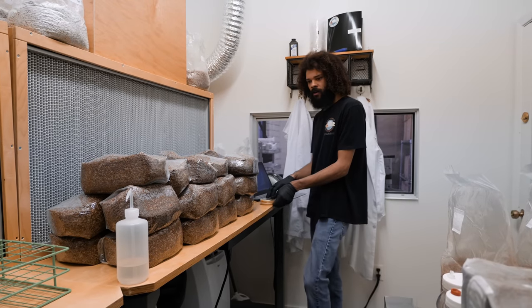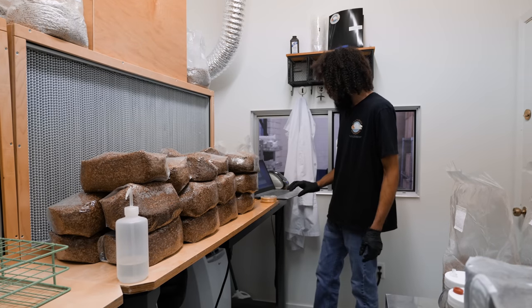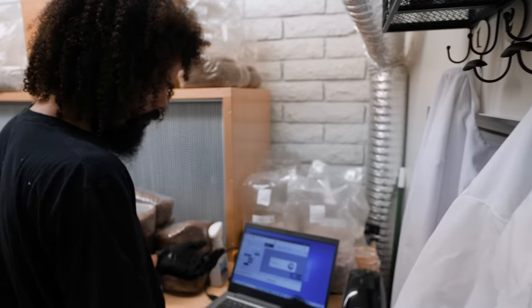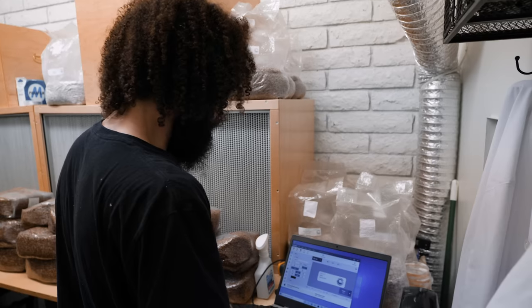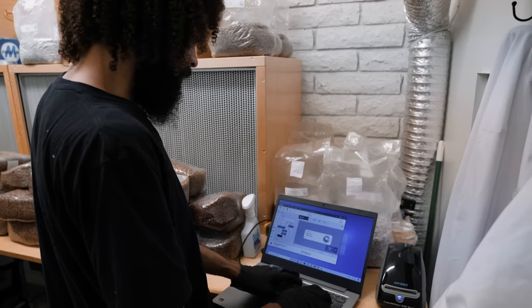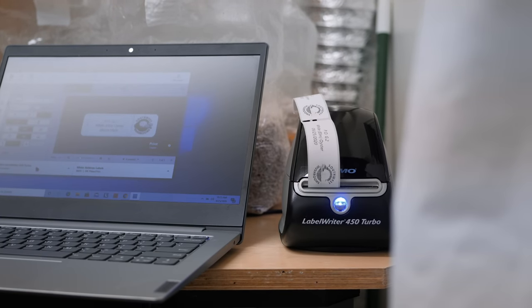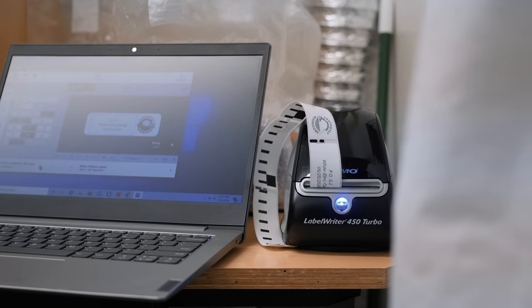When you're working on a mushroom farm, every second counts, especially when you're in the lab and need to get to other places. So I'll put G2 on my label so I know it's generation two for production. I make sure to put the species or strain on the label as well, so I know exactly what it is. You don't want to mix anything up — and make sure you get the date on there too.